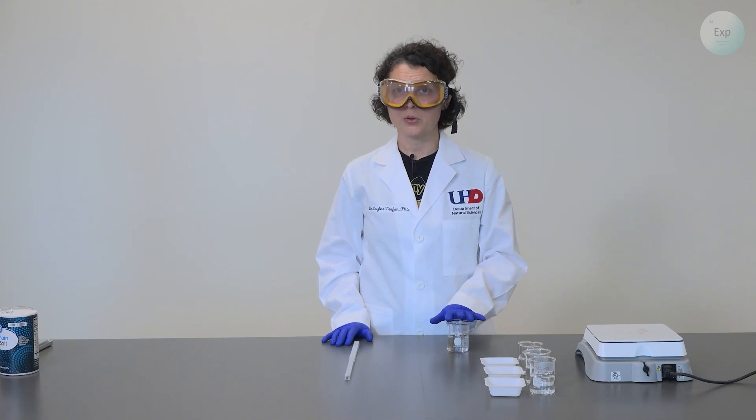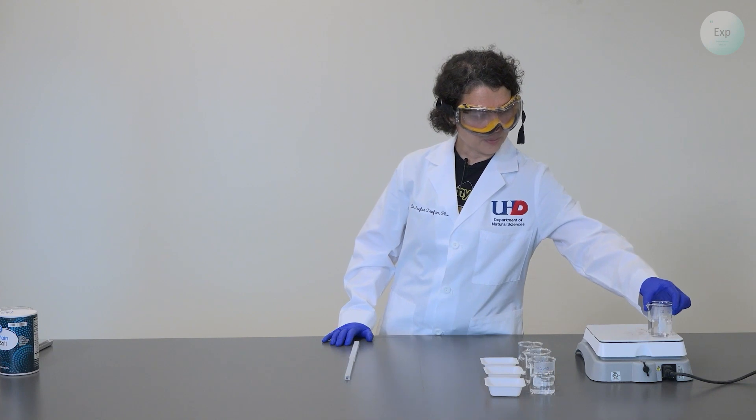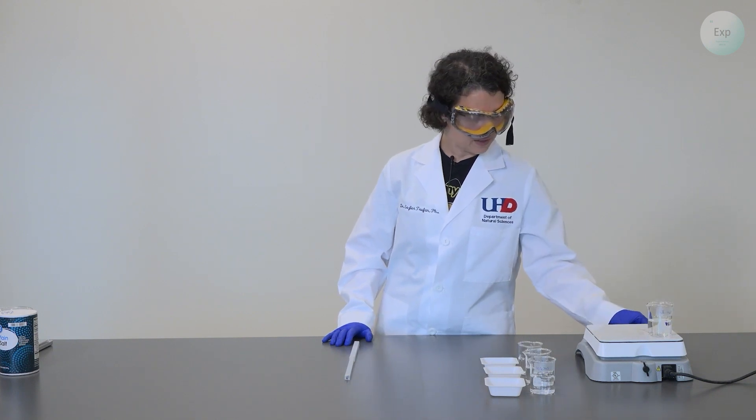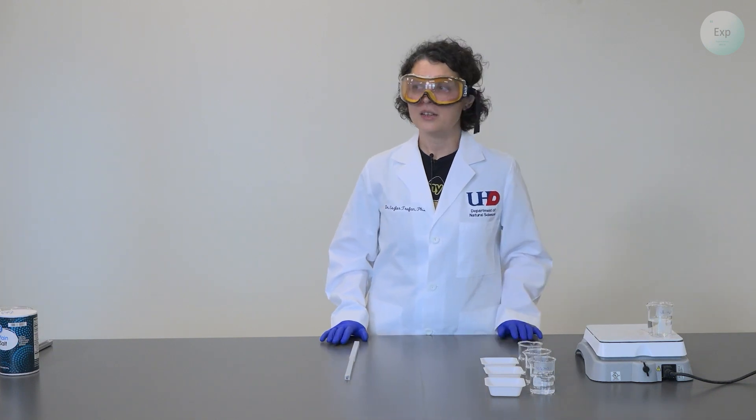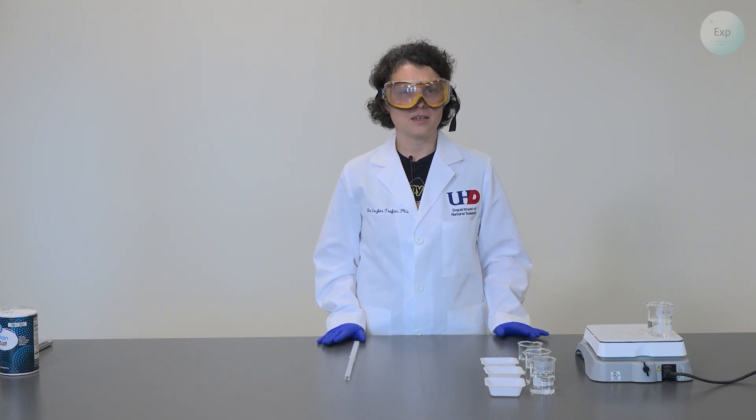First, I have my pure liquid, which is the water, and I will place that on the hot plate. I can start the heating. The heating should be set at a low medium or medium temperature so that it doesn't go too fast.